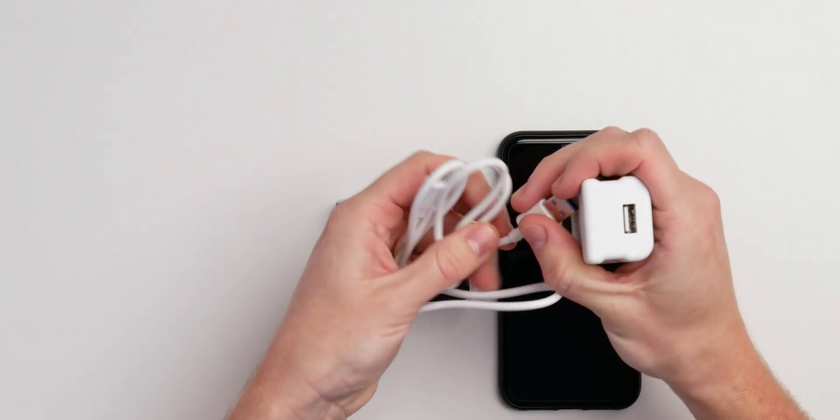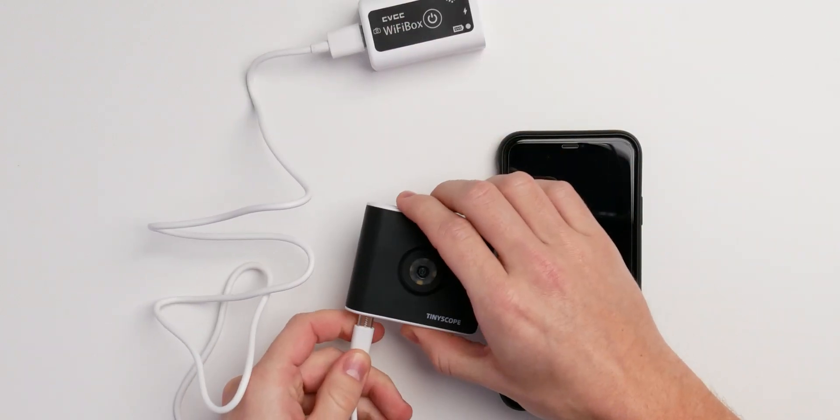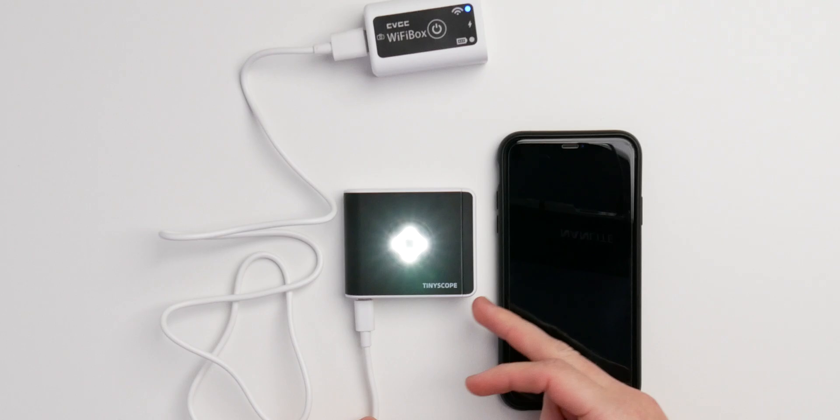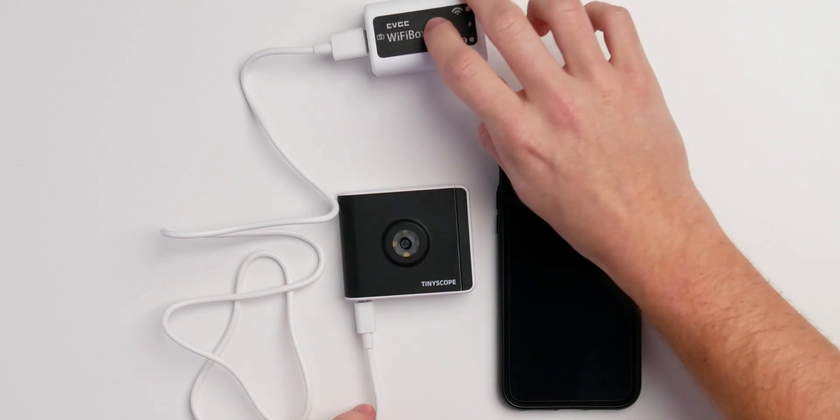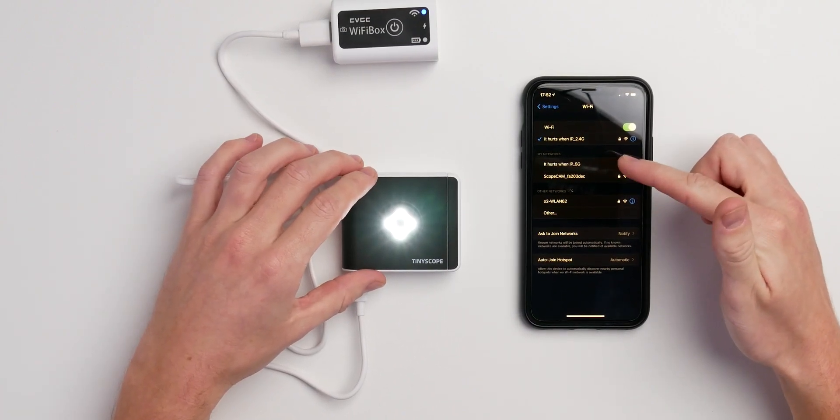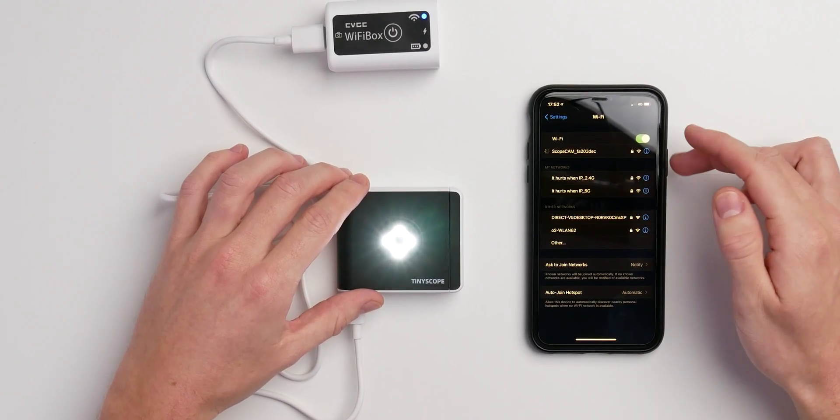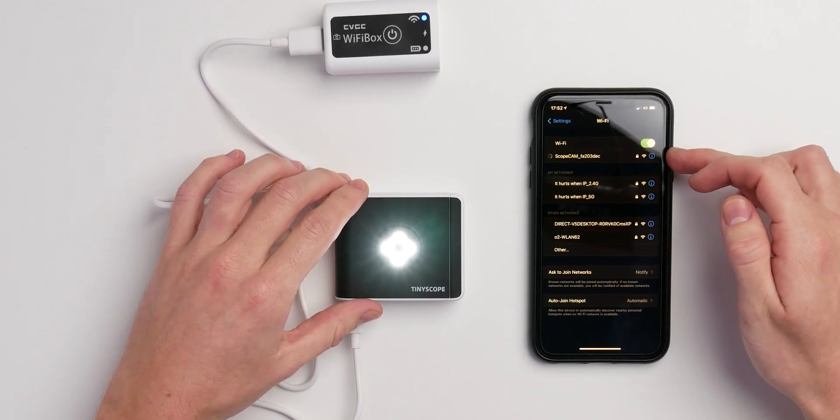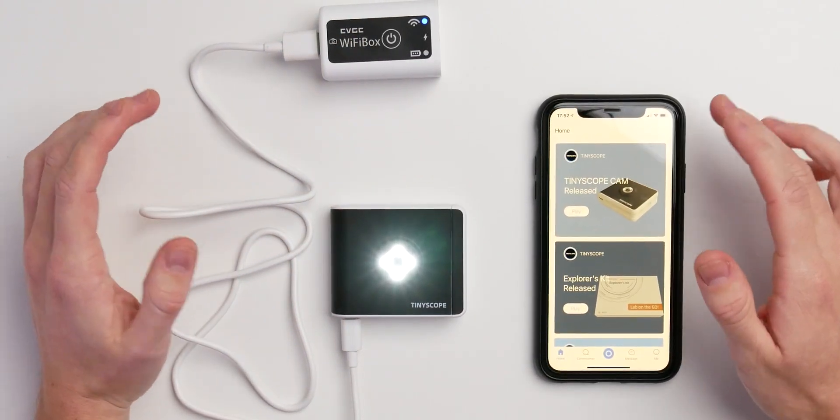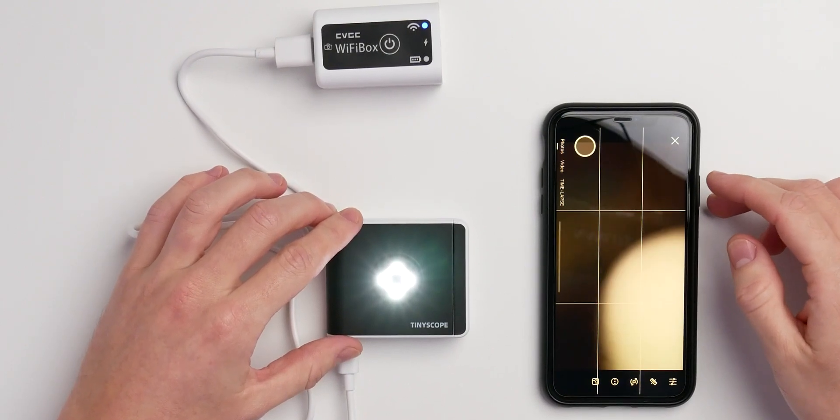So first thing is just connect the WiFi box to the TinyScope. And as soon as I'm turning it on, you will just probably be blinded by the lights. First thing we just need to do is connect to the WiFi box I have here, ScopeCam. And as soon as my WiFi and my iPhone here is connected to the WiFi box, you can just go to the TinyScope app you get for iOS and Android. And then we can just select the TinyScope.